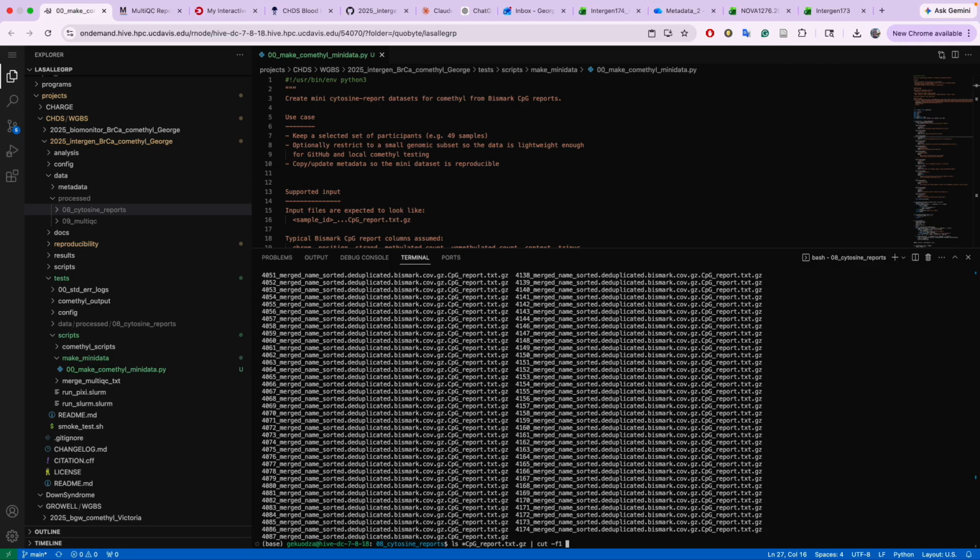If I fail, we'll just use AI. Okay. I'm going to try and then run the cut. Let's see. No such file or directory.